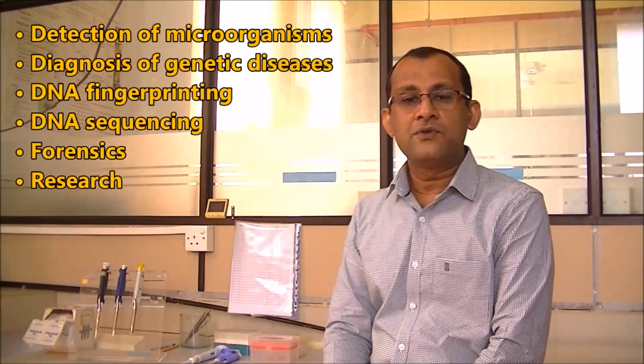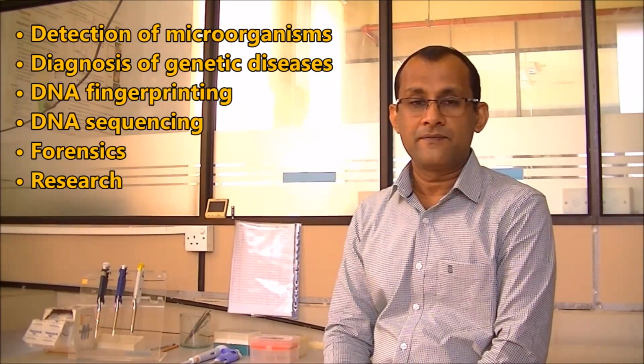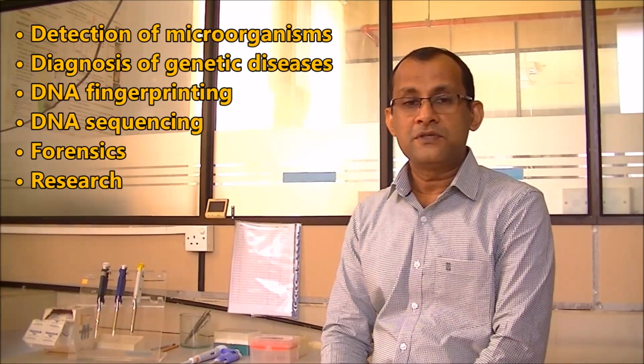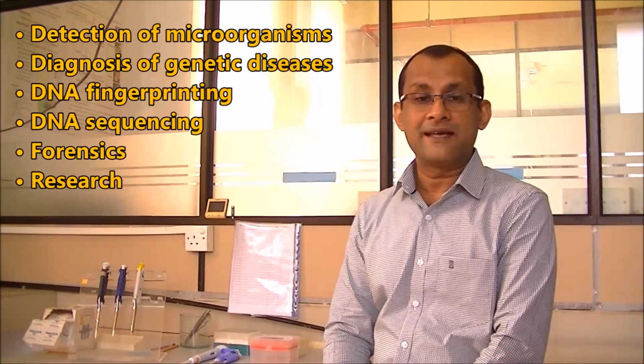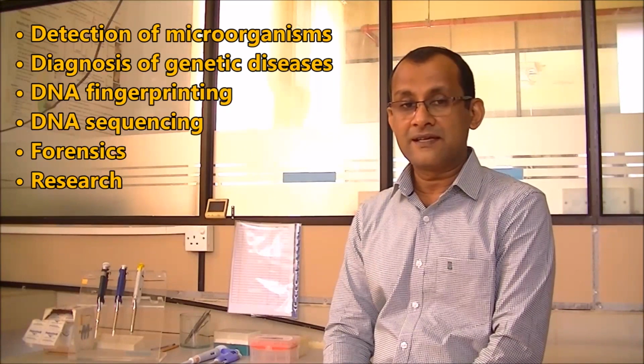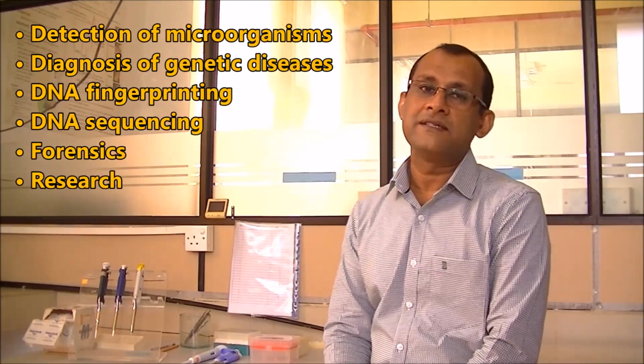PCR is one of the most reliable methods to diagnose an infectious disease. It is being used not only for medical diagnostics but in many fields in science, including forensic science, DNA sequencing, research in science and medicine.